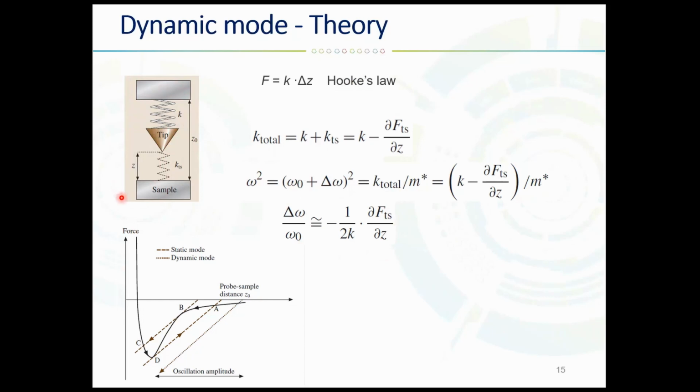However, we neglected quite an important issue for AFM so far: the mechanical stability of the measurement. So in static AFM, the tip approaches the surface very slowly, and then the force between the tip and the surface will always be counteracted by the restoring force of the cantilever. So this is what you can see on this picture.